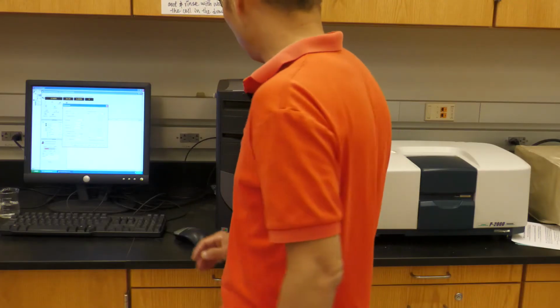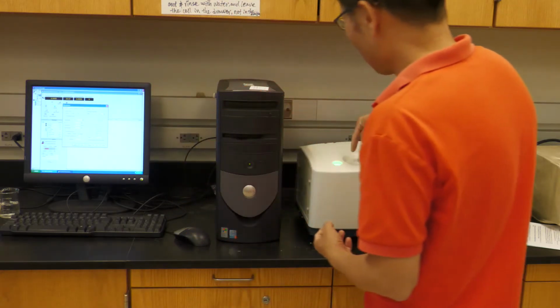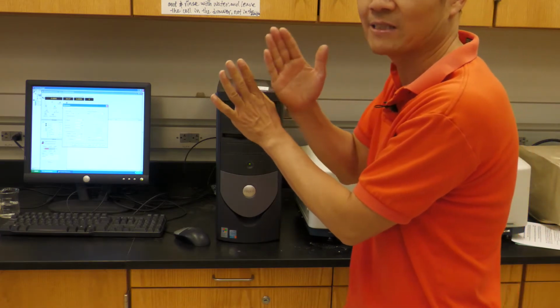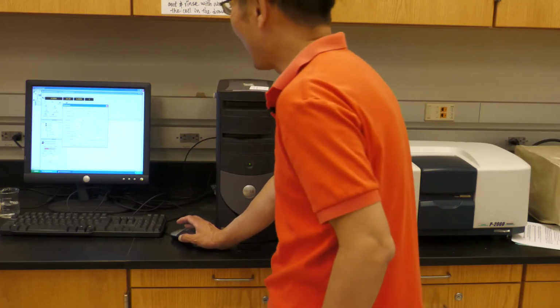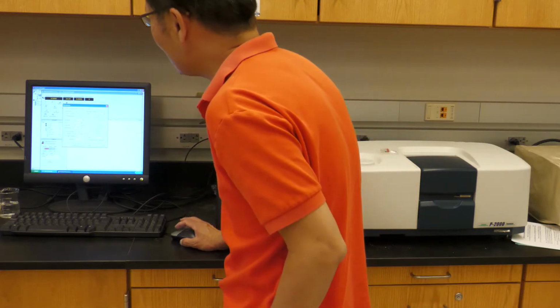What does that mean? That means each time they measure 5 seconds, the light keeps shining for 5 seconds because they want to average to get the best signal to noise ratio. So the cycle time, that is 100. Basically, that is just 100 points, okay? I ask you guys to set 100 points because you might not need 100 points.